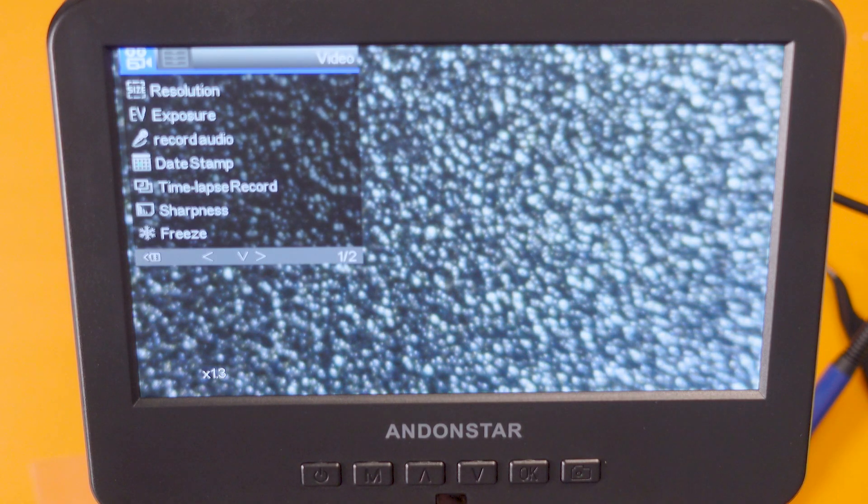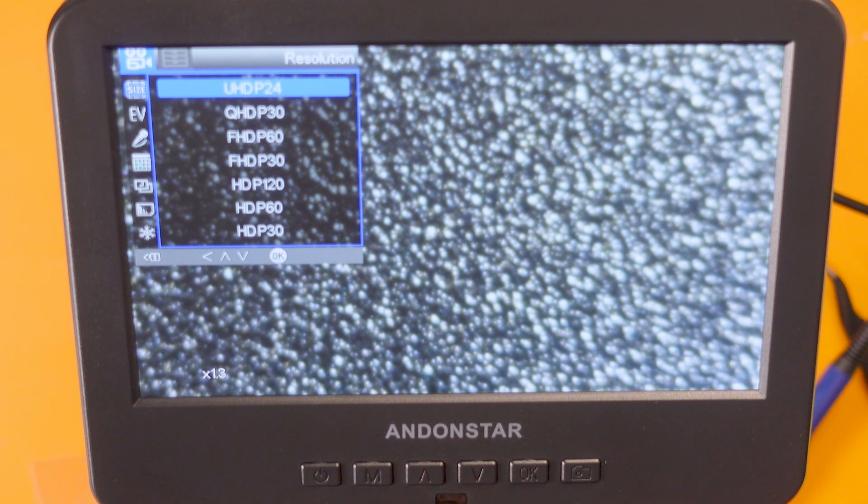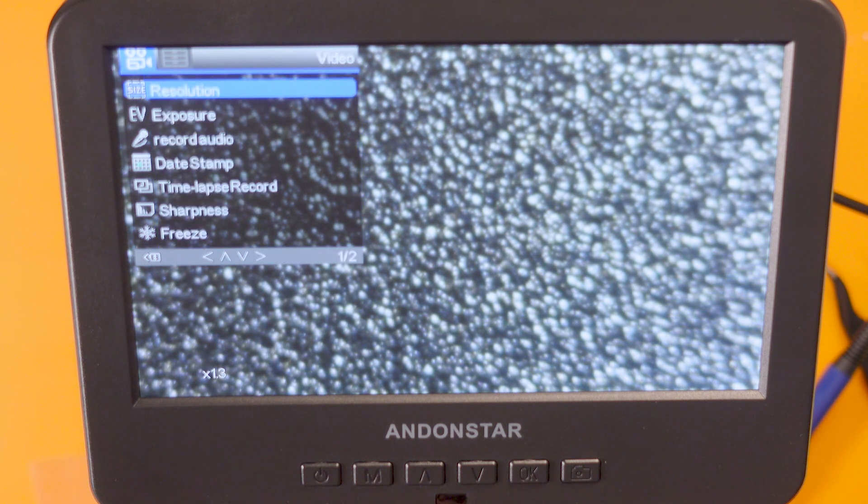Why don't I show you quickly through the menus. So let's go through the menu — we've got resolution. I've gone for UHD, so 4K at 24 frames a second. There's all sorts of different resolutions, even HD at 120 frames per second. We've got exposure, you can change whether you turn audio recording on or off. Note from editing: that audio record function doesn't actually work — it just records a blank audio track, which is a bit rubbish. We can also add a date stamp, do time-lapse recording, sharpness and freeze so you can just freeze the picture, and then contrast and colour settings.